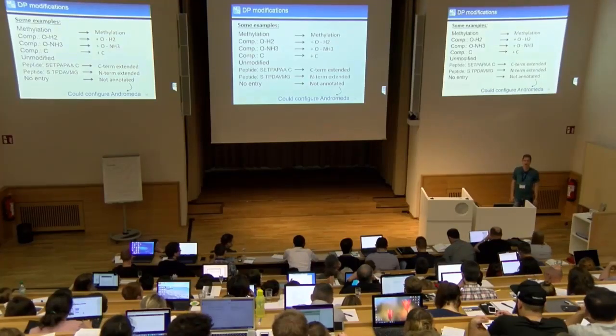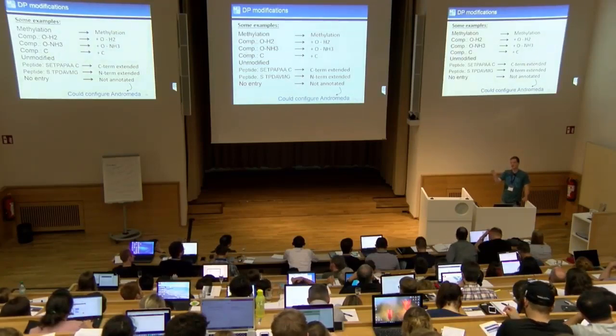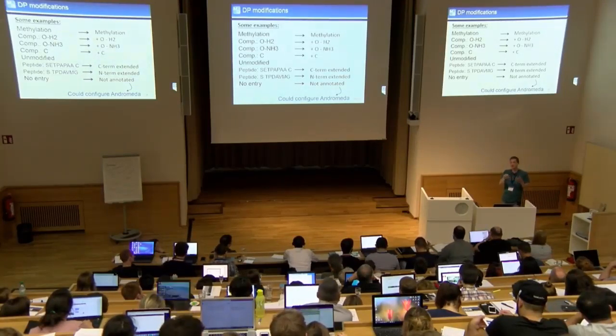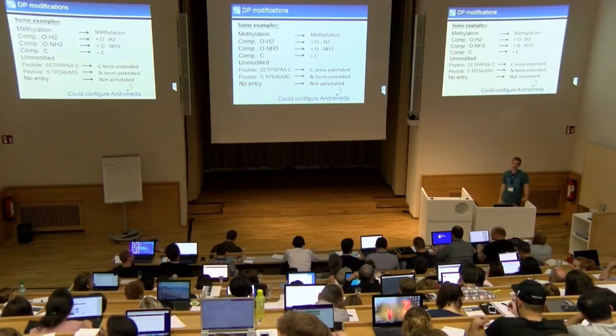Would that be a way of modifying or complementing this approach, or is that also not possible in terms of FDR? Yeah, I think it's very difficult, without knowing the sequence of the peptide, to say much about it. If you're an expert in a specific domain and you are expecting specific mutations, maybe from proteogenomics, then you will have this either encoded in your database directly or with variable modifications. I think these are the most robust tools for the analysis. But in principle, you know the peptides, you just don't have them identified.